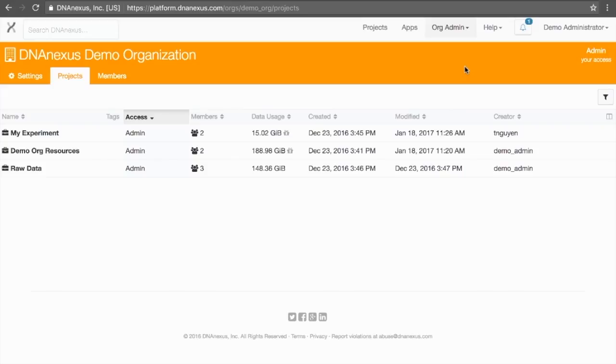As you have seen, by billing a project to an org, the user who created the project has assigned ownership of the project to the org. You, as the org admin, the administrative user in the org, have the ability to discover and oversee all org projects as well as revoke permissions to any project billed to the org.